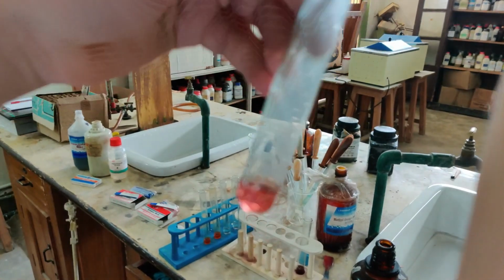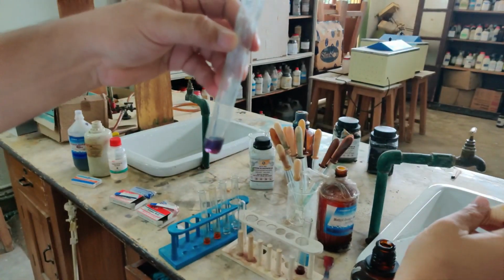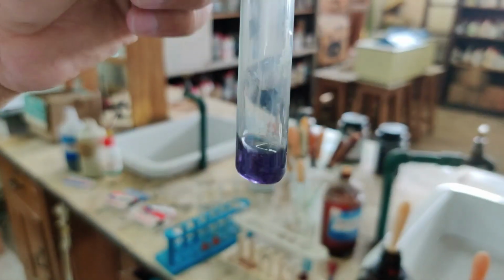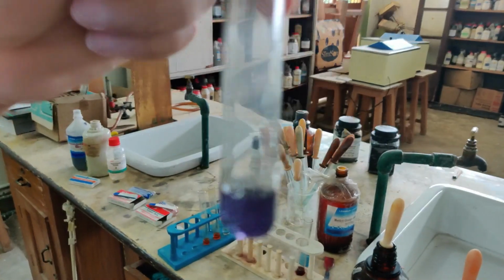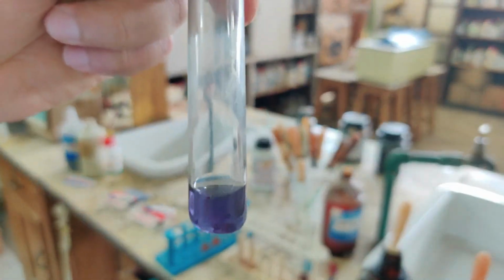See very carefully now. There I am adding. Just 2-3 drops is what I have added. Just by the addition of 2-3 drops, now see how the color changes. And if I shake it, the whole solution is turning blue. So a blue litmus turns to red and a red litmus turns to blue. Now it has turned a very nice blue. See it again carefully.